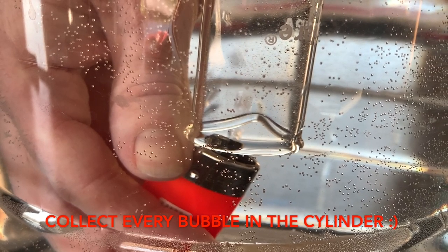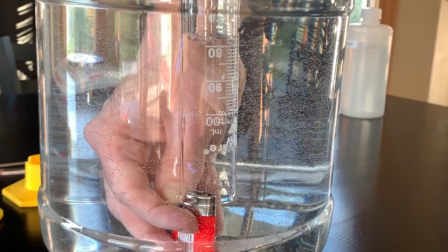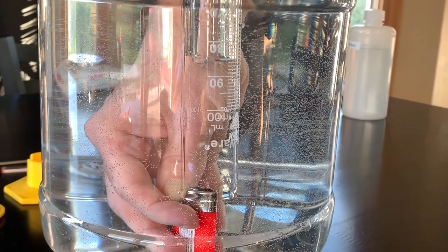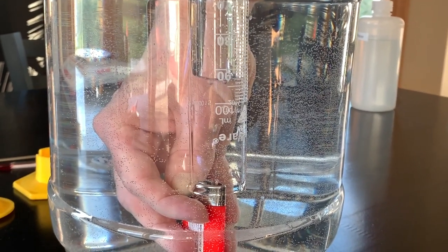Make sure you collect every gas bubble that comes out of the lighter and collect a total volume of 70 to 90 milliliters. Do not go past the 100 milliliter mark or you will not be able to get an accurate volume.